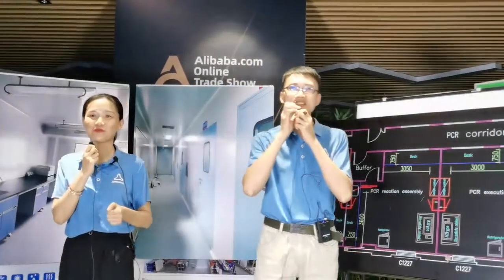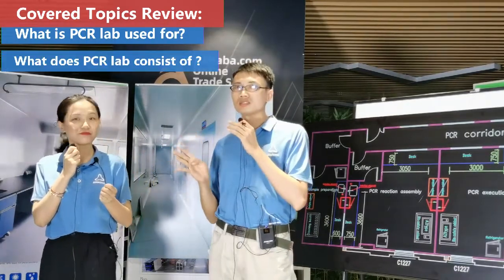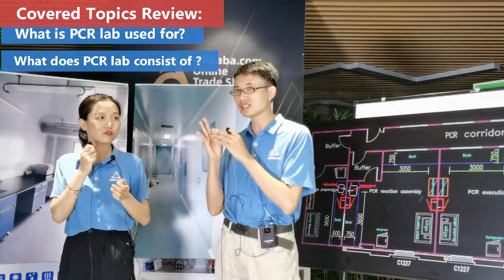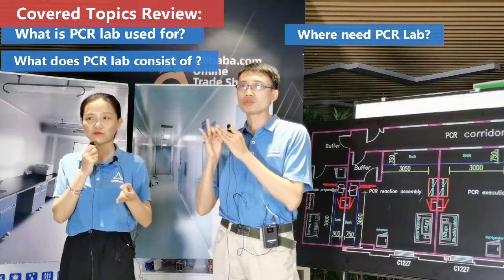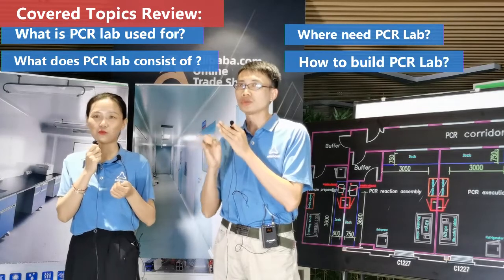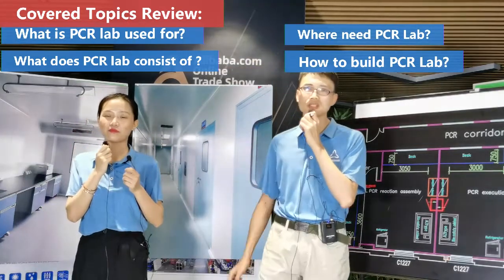Okay. And thank you. And so, in your introduction just now, you talked about 4 topics, right? Yeah. Number 1 is what a PCR lab is used for, right? Yeah. Number 2, what does a PCR lab consist of? Yeah. Number 3, where do you need a PCR lab? Yeah. And number 4, how to build a PCR lab? Yeah. Okay, right, and that's a great topic.